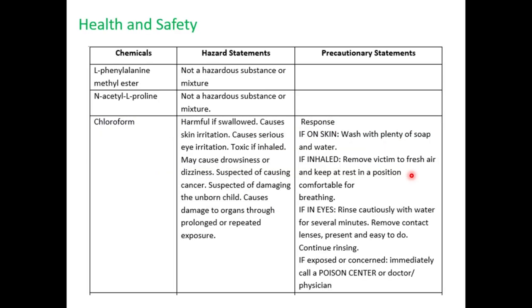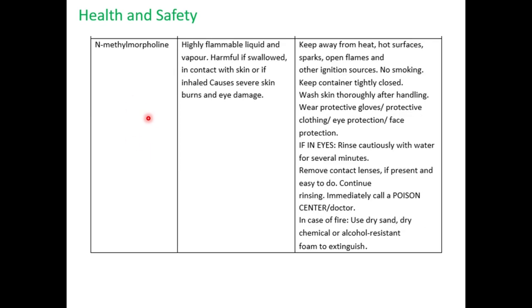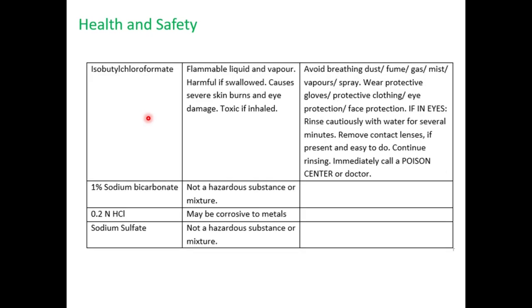So in terms of today's experiment, do look at the health and safety and hazard statements in your manual, particularly mindful of chloroform, N-methyl morpholine, and isobutyl chloroformate.